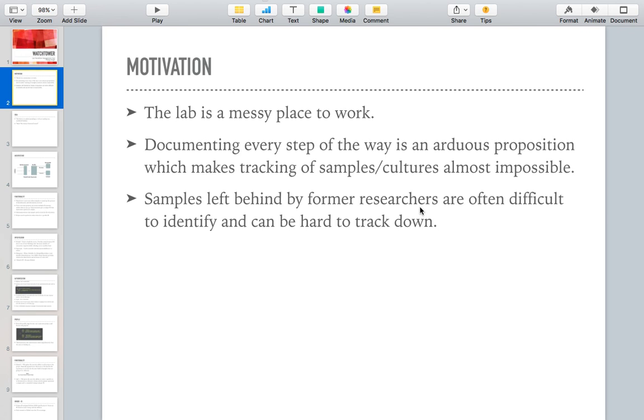So it saves the immediate file, and you have an idea of what the entire project as a whole is, because you can go up and down in that project, and you can see what the file before it was and what the file after it was in the directories above it and the directories below it. And also you can commit the same file again and again, so it also tracks which version of the file you're working on right now. In the head, it has the latest version, and it has the mistakes you made in the previous version or the changes you made in the previous versions.